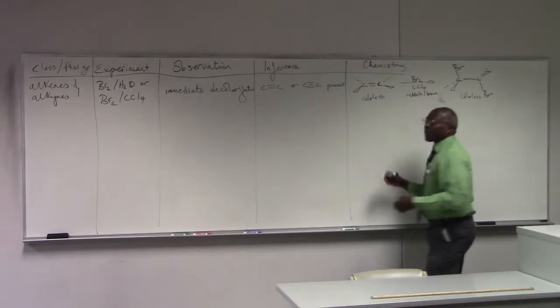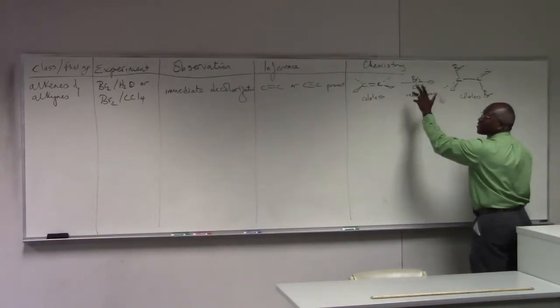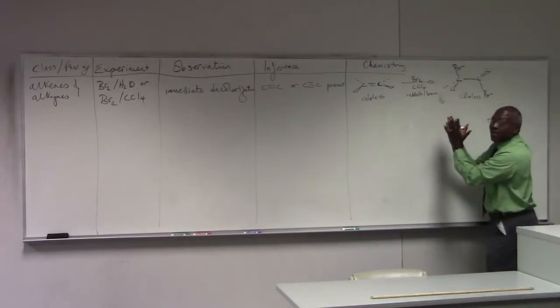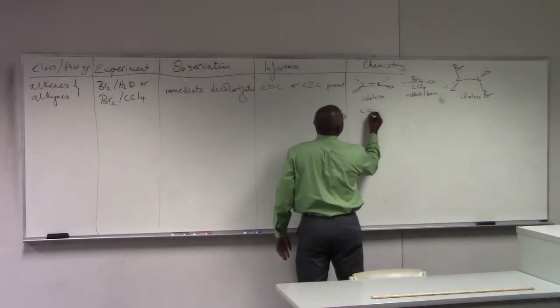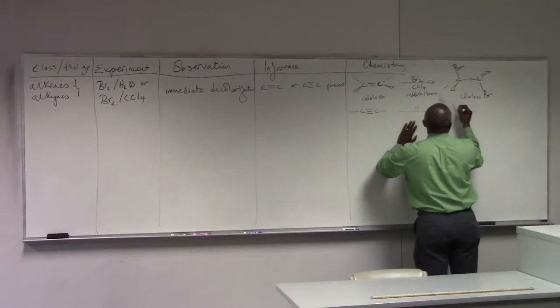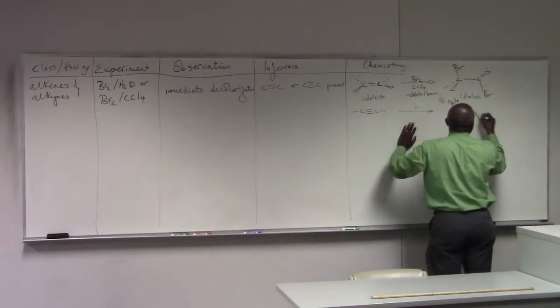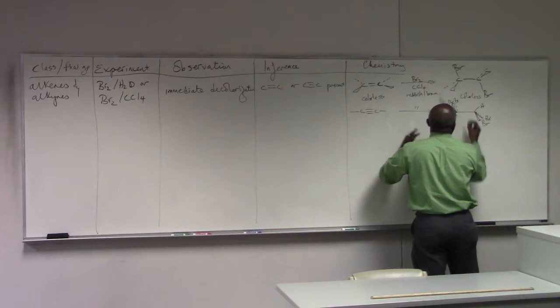So when you add a reddish brown liquid to the colorless solution, it forms a colorless product, which means the color is discharged. This reaction, if you remember from your organic one, goes via the bromonium ion, and then the bromine attacks on the other side. If instead we have the alkyne, then the reaction is very much the same. We will add across each double bond and end up with the tetrabromo product, Br, Br, H, Br, Br, and H. And again, this is also colorless.